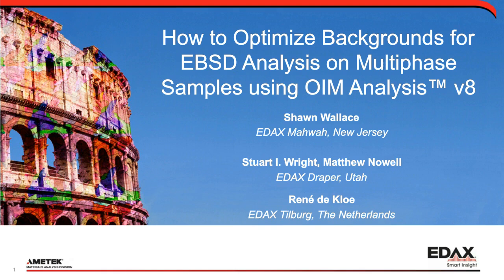So the reason I'm doing this is, OIM Analysis has been out there for a while now, but I'm really starting to use more of its features every day. And with that, you start finding little things in there that might not have been put in on purpose, but really change how you collect your data and how you play with your data. It really affects my day-to-day use of what I'm doing.